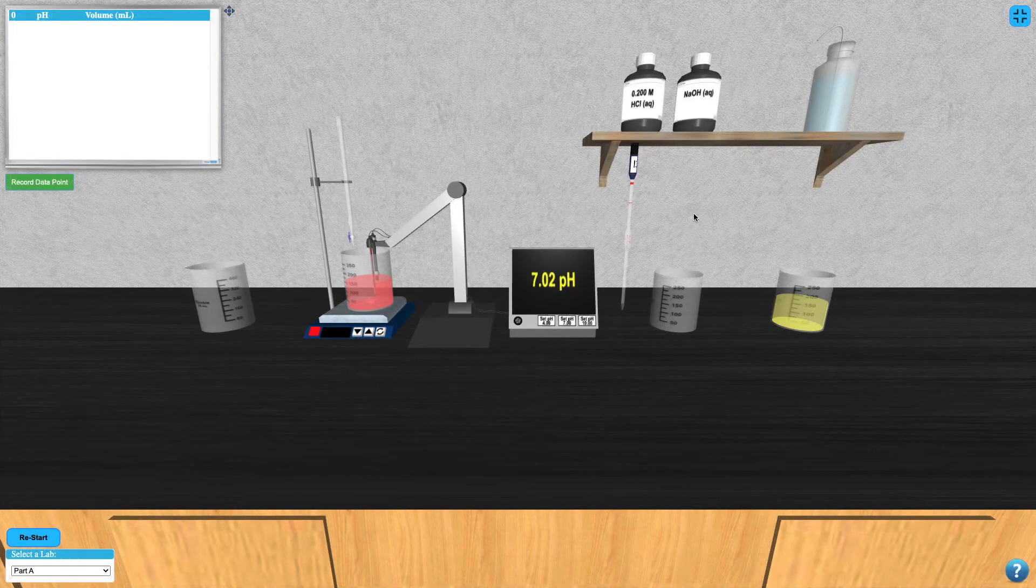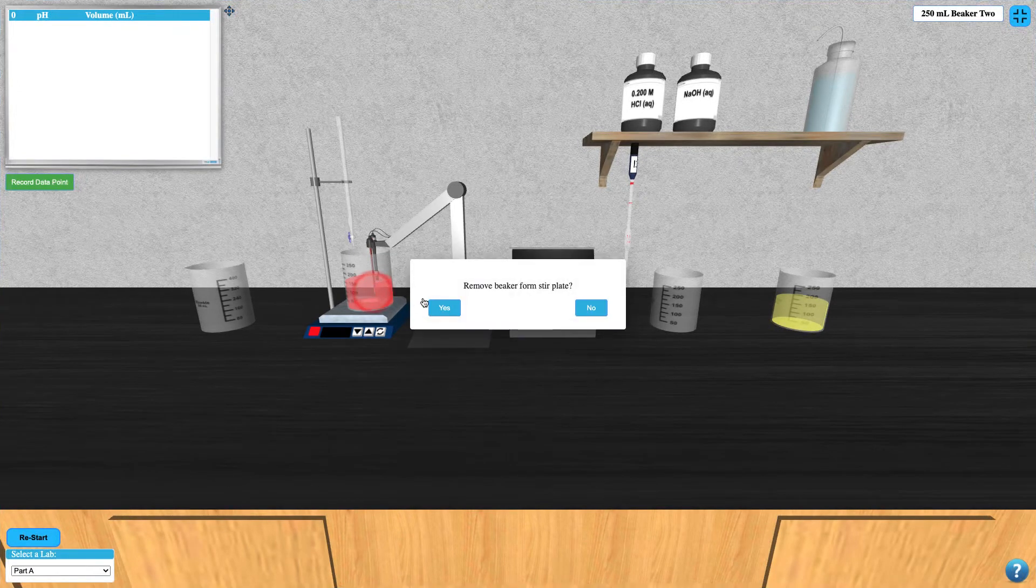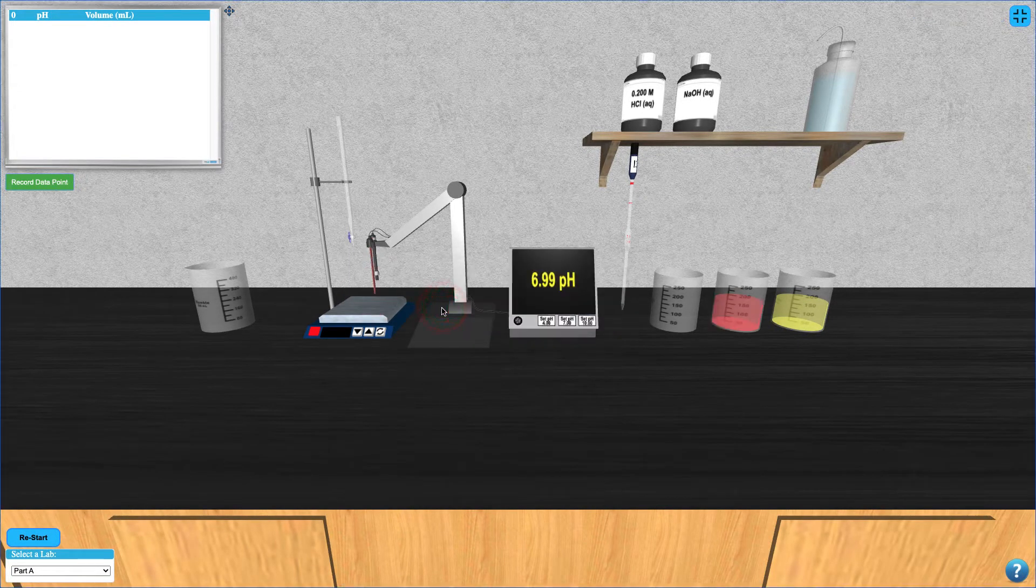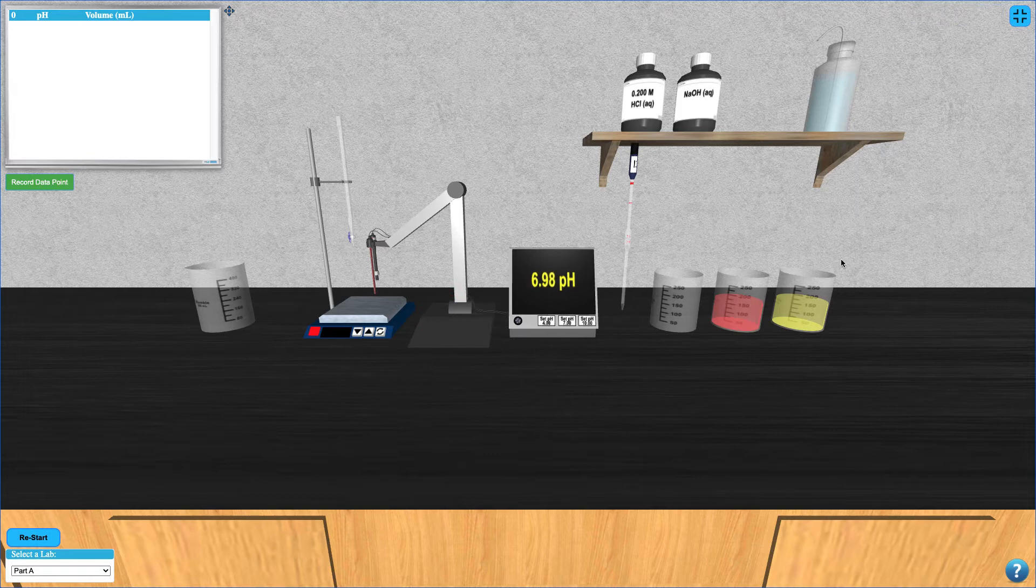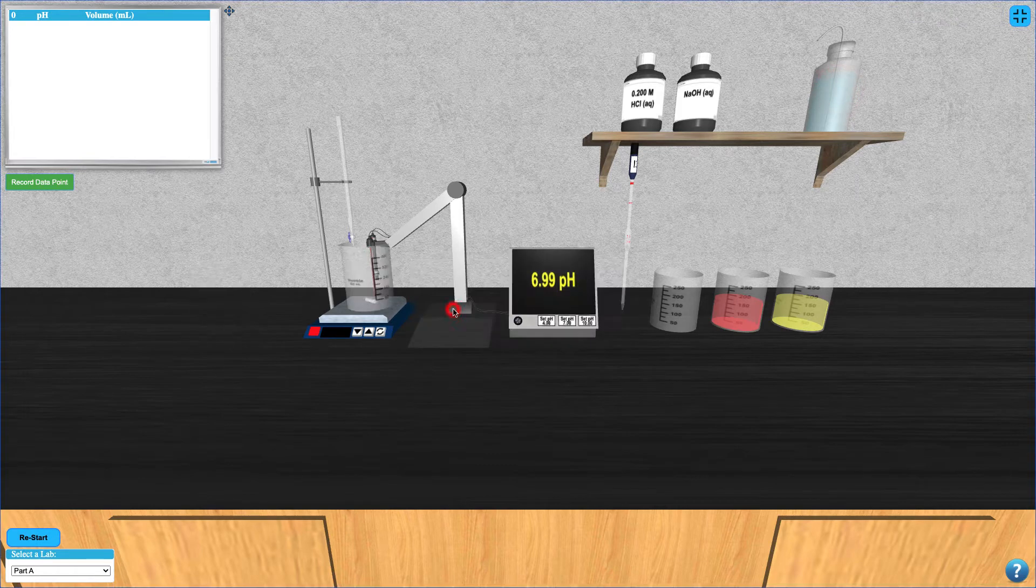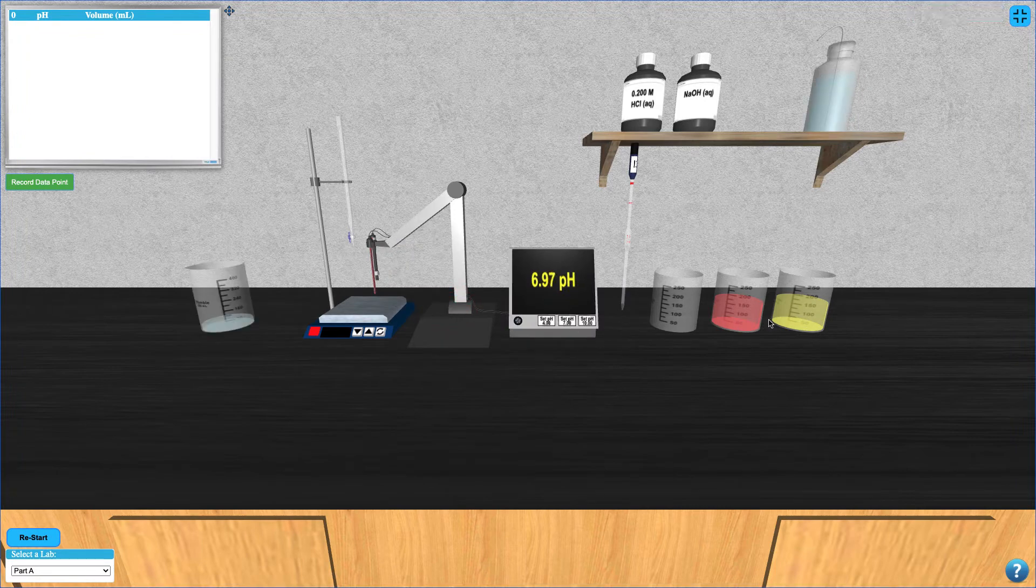To begin, click on the beaker with the pink liquid to remove it from the stir plate. This liquid is used to store the pH electrode so it doesn't dry out. Next, click on the deionized water bottle to give the pH meter a rinse.